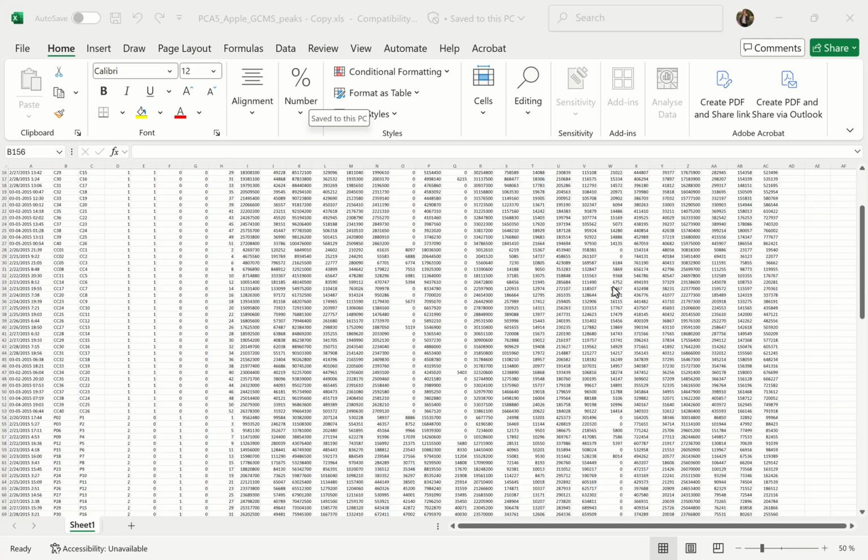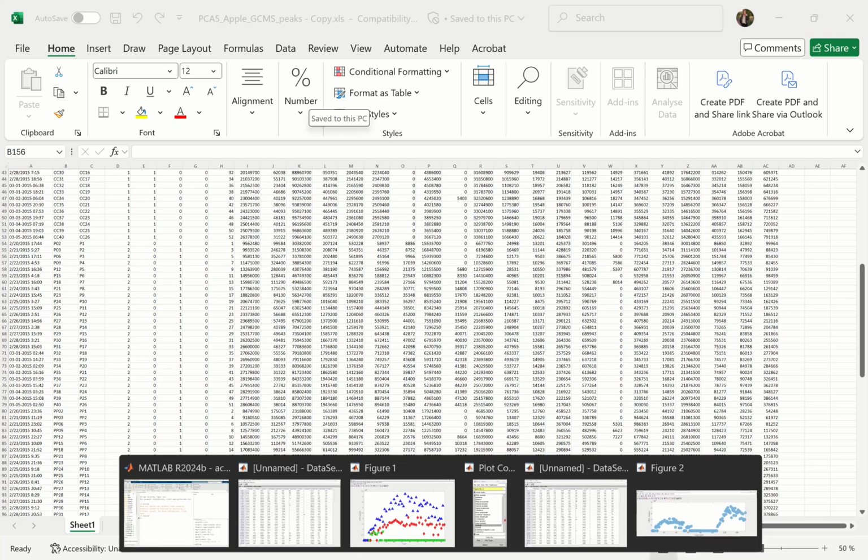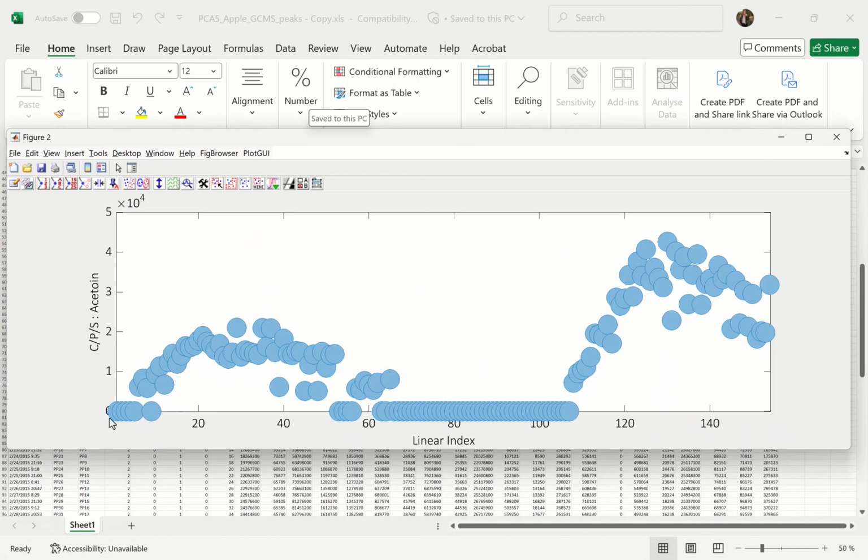You can see that there's a number of zeros here. Let me actually show you a plot of this. Here you can see this is basically following a fermentation with one species, another species, and another species. So we have three different fermentations, actually two fermentations of each.